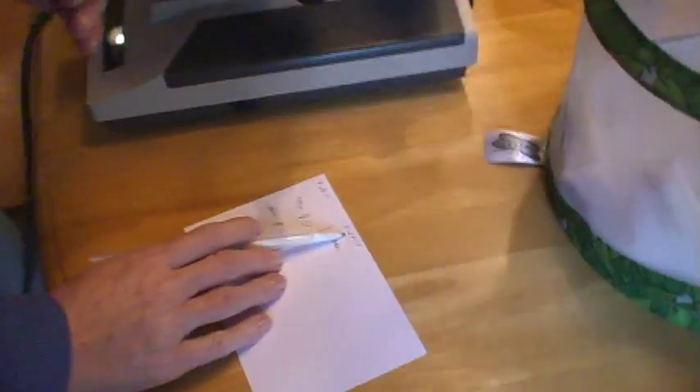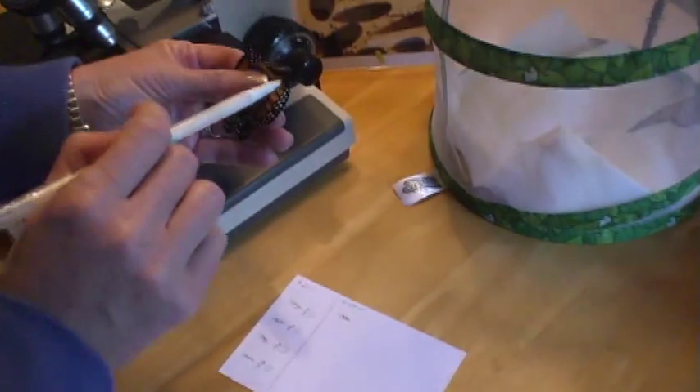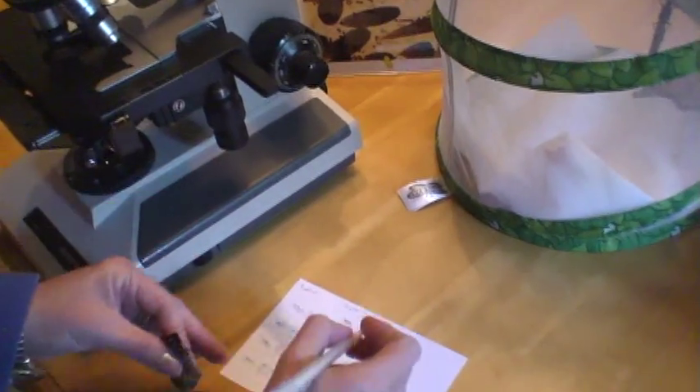Place it on a card, just a regular index card. I write down the date, and I also write down whether it was male or female. I can tell by the claspers here — this is a male.